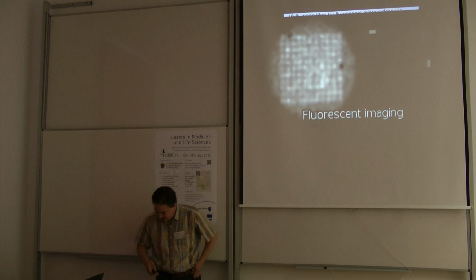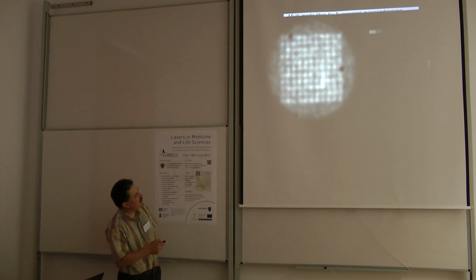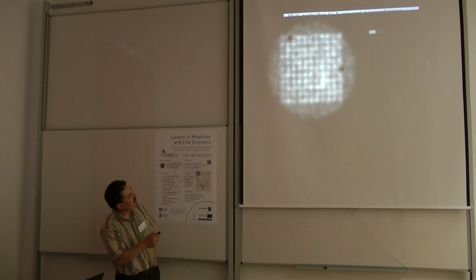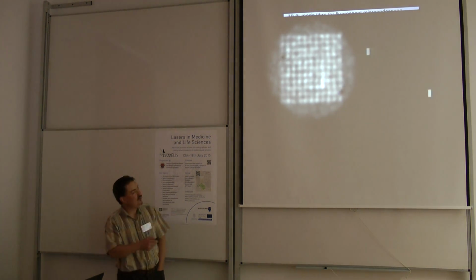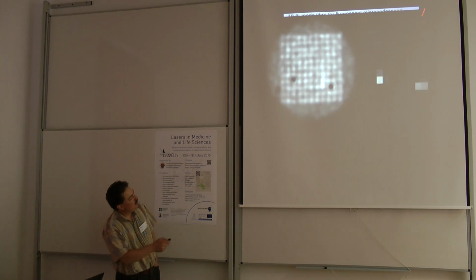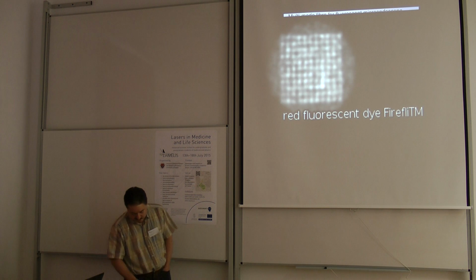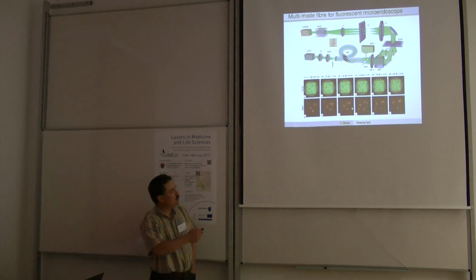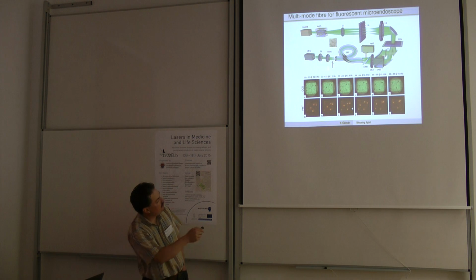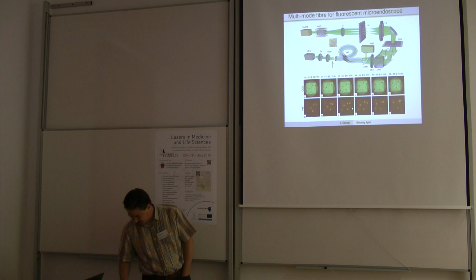And this is how it looks like. So this is sort of a passive regime. Here are a couple of particles. And when they get excited, you can see the really quickly scanned points. And you don't see it scanning because it's really fast. It's a couple of tens of kilohertz. But you can see the response in here. So I should say that when you excite the fluorescence, you collect it backwards through the fiber, separate it here, and detect it on the photomultiplier tube.